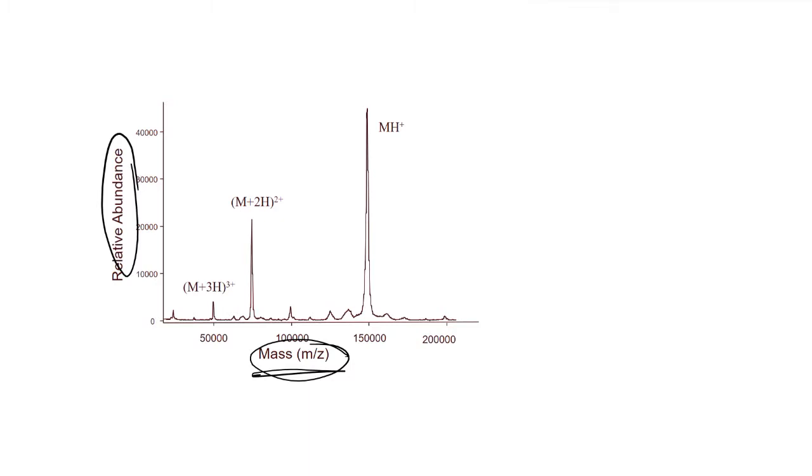The main thing we're interested in are these adjacent peaks here and here. They can be any two adjacent peaks, but in this particular spectra we don't have too many. I'll call this one A and the next one B, and we note that A is greater than B. So A would be about 150,000, and B would be somewhere between 50 and 100, so 75K. But the units don't really matter.